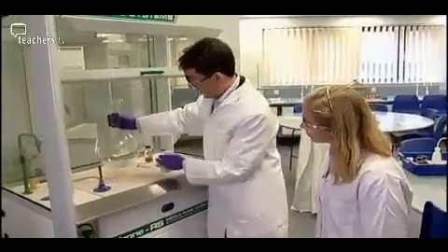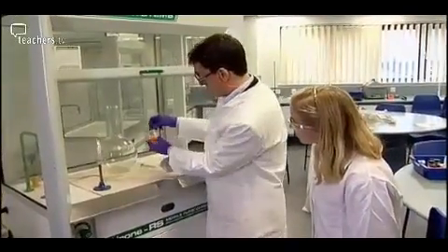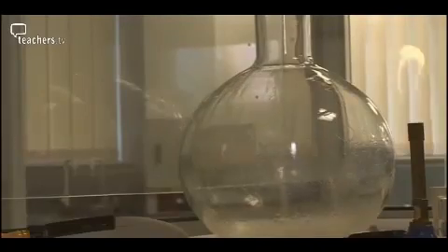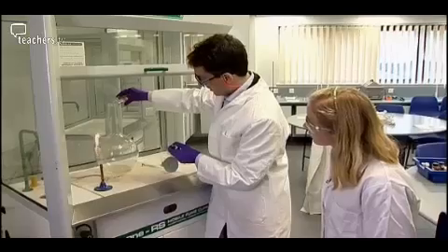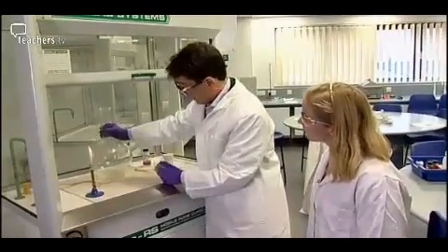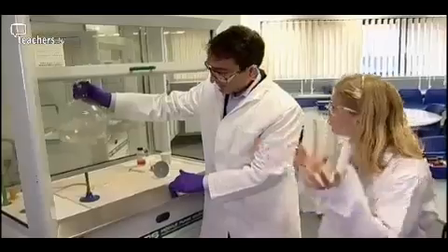I've got this really nice big flask, and I'm going to put some concentrated ammonia solution in the bottom, which I've got right here. Because there's so much ammonia in solution, you get ammonia vapour being released into the air in the flask. And I just gently warm it up, really trying to encourage the ammonia gas so the vapour really fills the flask.